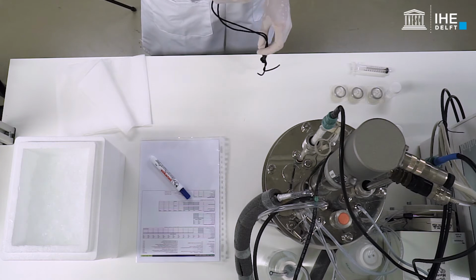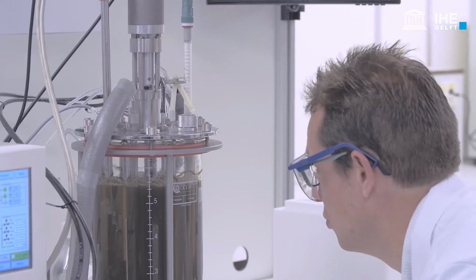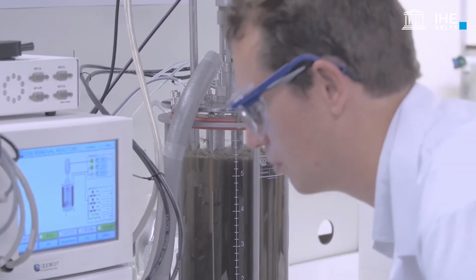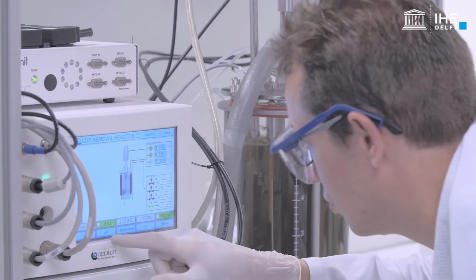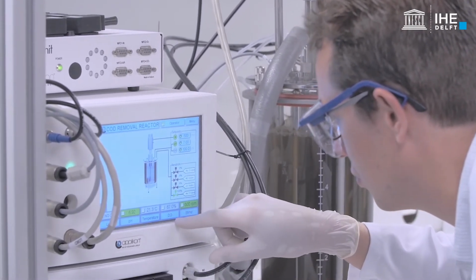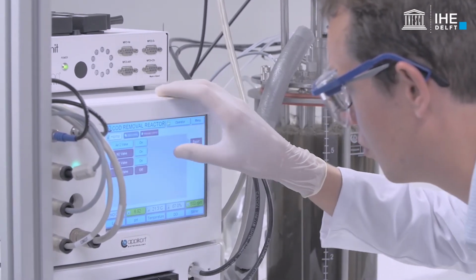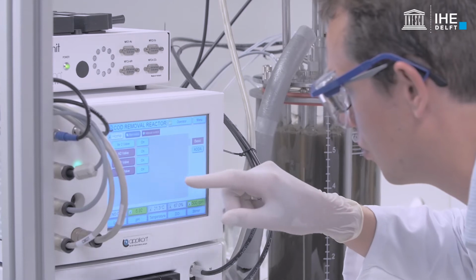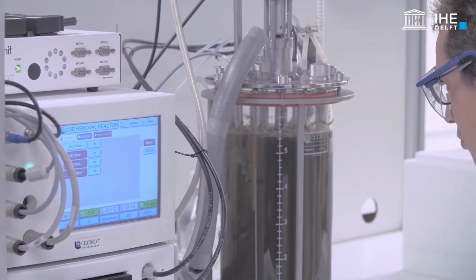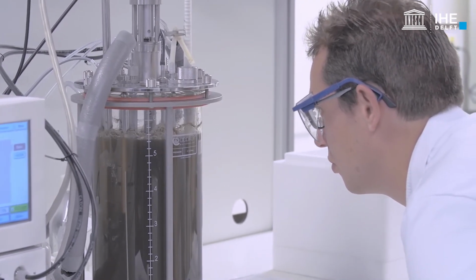Confirm there is neither sludge stratification nor dead volumes. Also, verify that the operating and environmental conditions are stable. If the conditions are stable, the preliminary samples can be collected. The sludge samples need to be homogeneous and representative. Thus, the external aeration can be temporarily turned off to avoid the excessive presence of air bubbles in the samples to be collected.